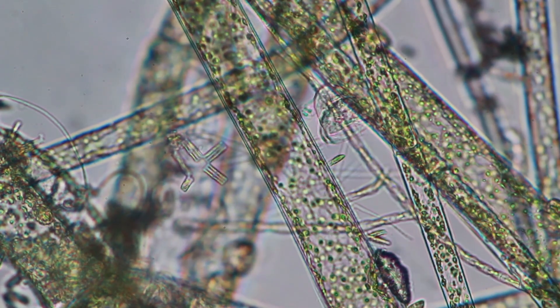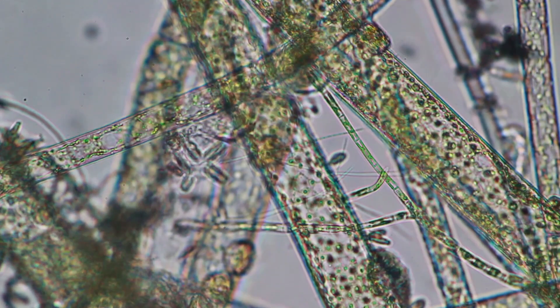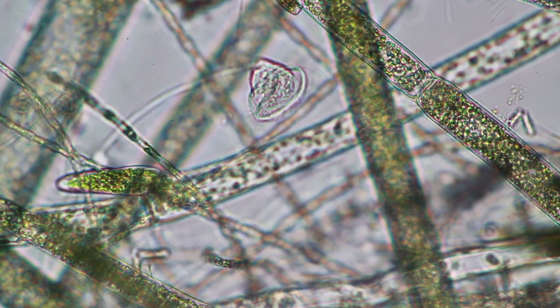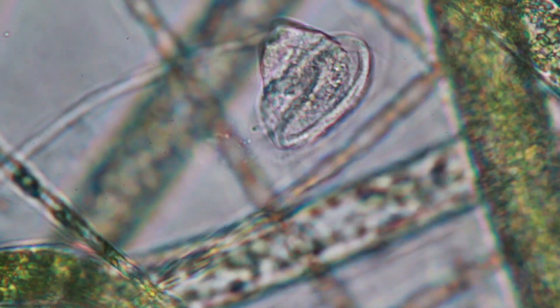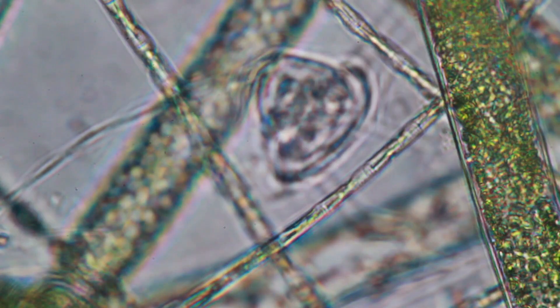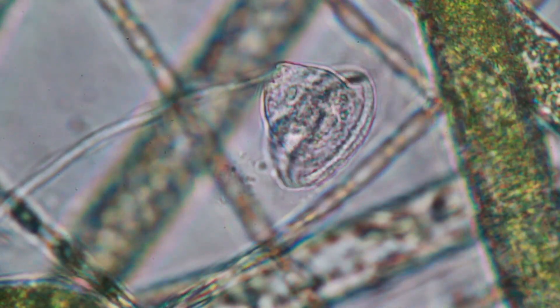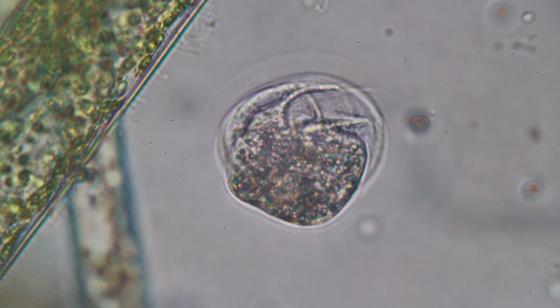At least I was quite happy to have found it, so I looked around and found a few more of these. Here you can see there is one here as well — it seems to be a little bit crooked, but you can see the cilia quite well: the ring of cilia which is rapidly beating. This is the way it moves the water and all of the suspended particles, and this is how it feeds itself. Unfortunately this one did not really retract — I waited quite a bit but it didn't. At least this is one of the few examples where I could actually see the movement of the cilia quite well.